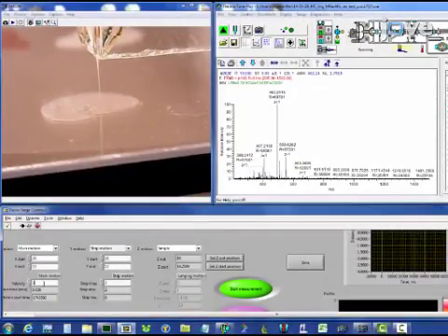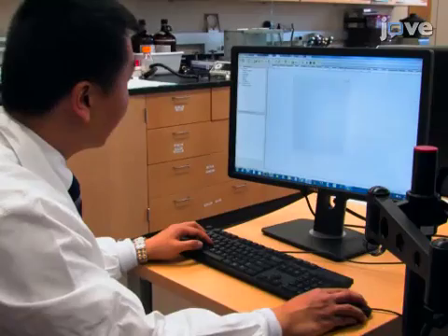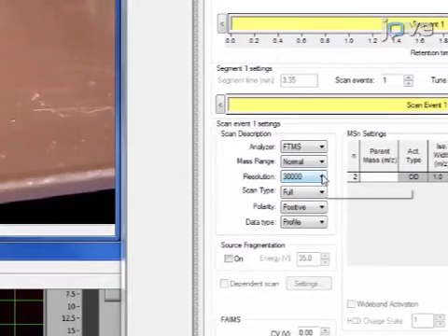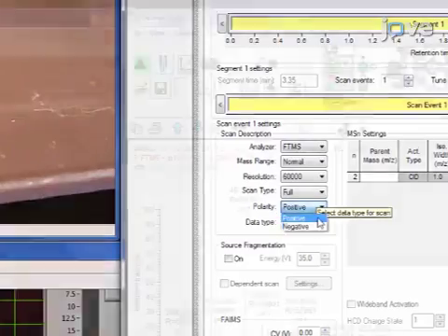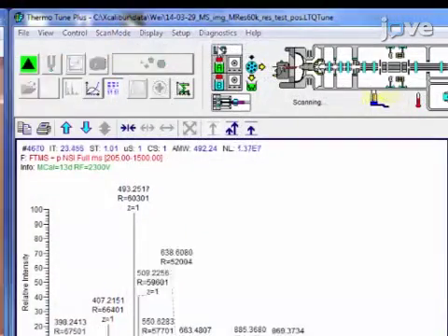Set the parameters for rastering across the section of interest within the sample. For the mouse kidney sections presented here, use a 10 micrometer per second rastering speed and a 20 micrometer distance between lines. Set up a method for the automated acquisition of MS spectra from the mass spectrometer. For high mass resolution MSI on a mouse kidney sample, use a mass resolution of 60,000, a 5 kilovolt positive mode, 1 microscan, 150 milliseconds maximum injection time, and automatic gain control on.